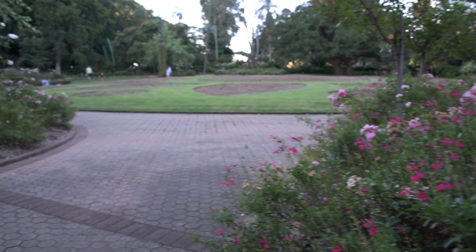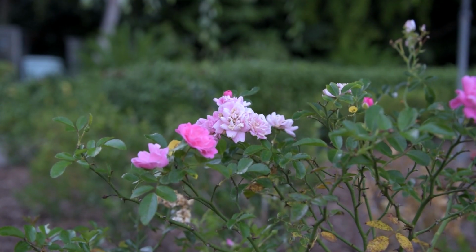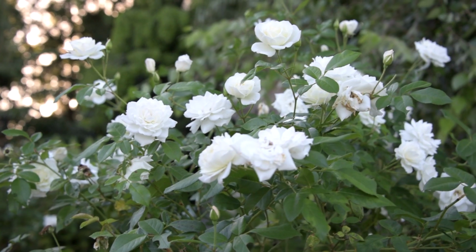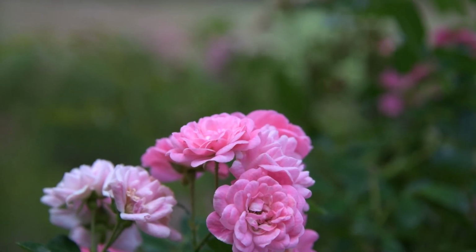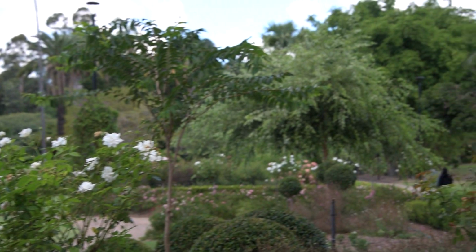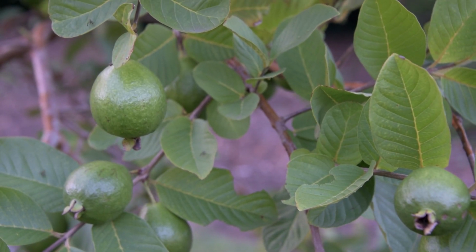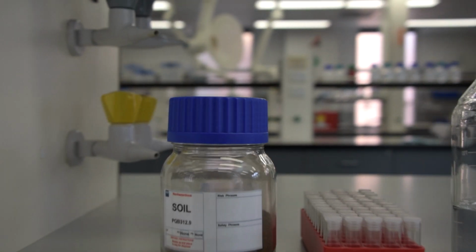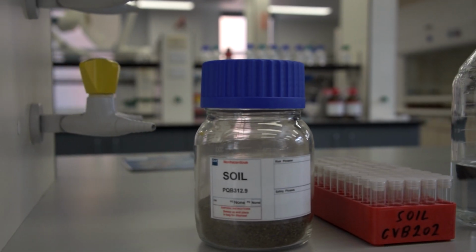In soils, potassium is derived from the weathering of feldspars and micas. Most potassium in soils is strongly bound to these volcanic minerals, and it is not until these volcanic minerals are weathered that the potassium becomes available to the roots of the plants. In this practical, we will measure the potassium which is available to plants in a sample of garden soil which has been used to grow vegetables. We will do this utilizing flame atomic emission spectroscopy.